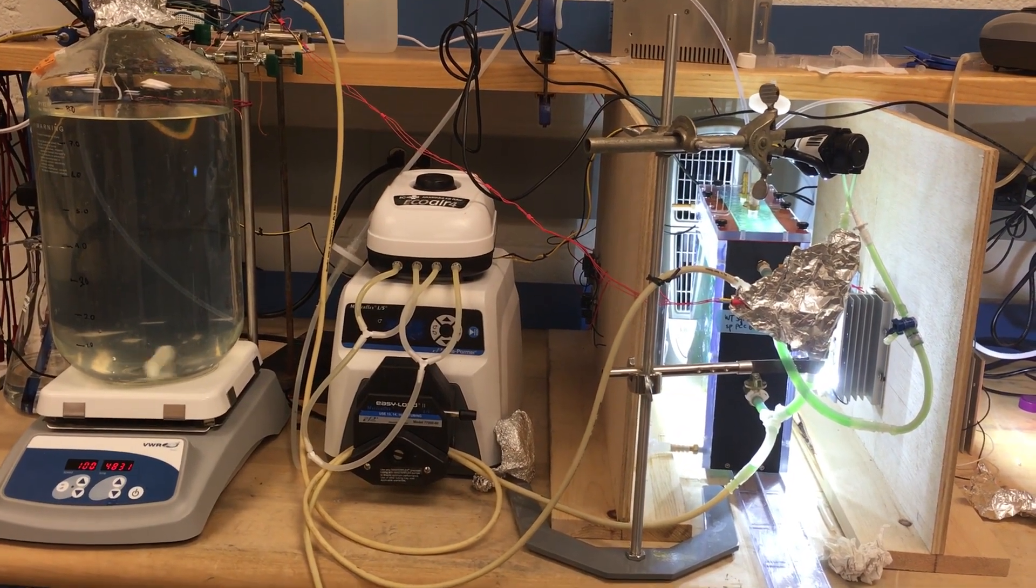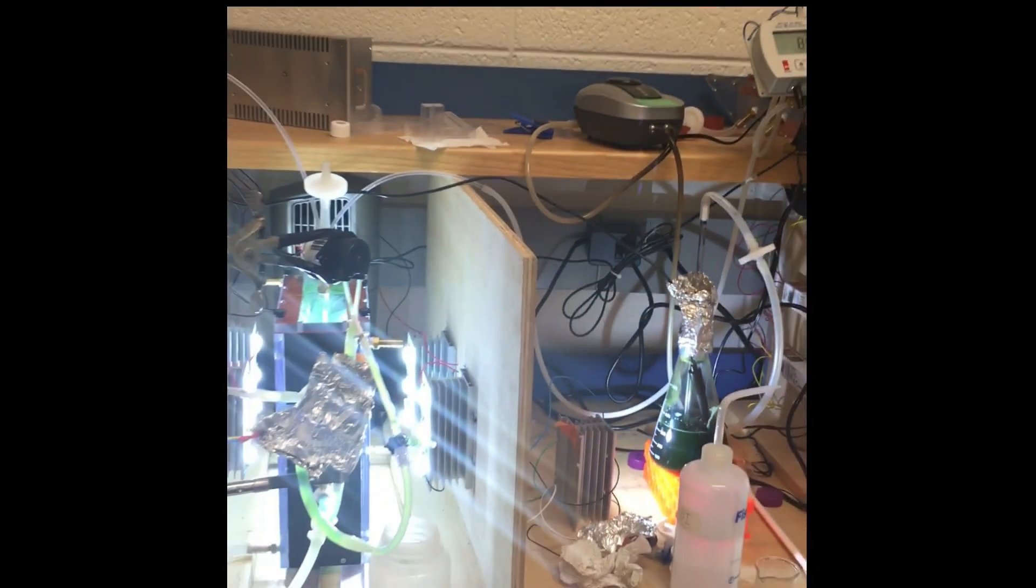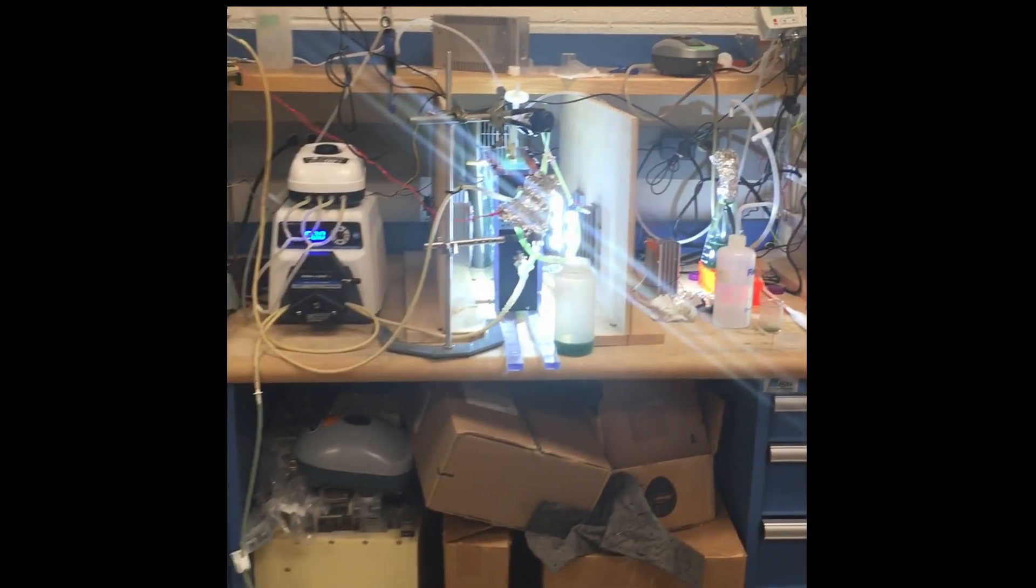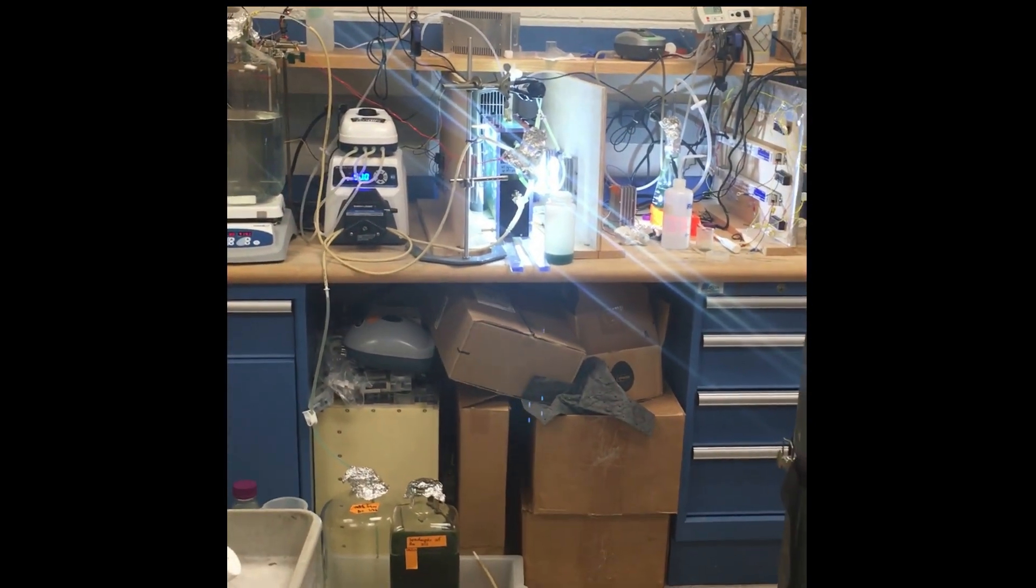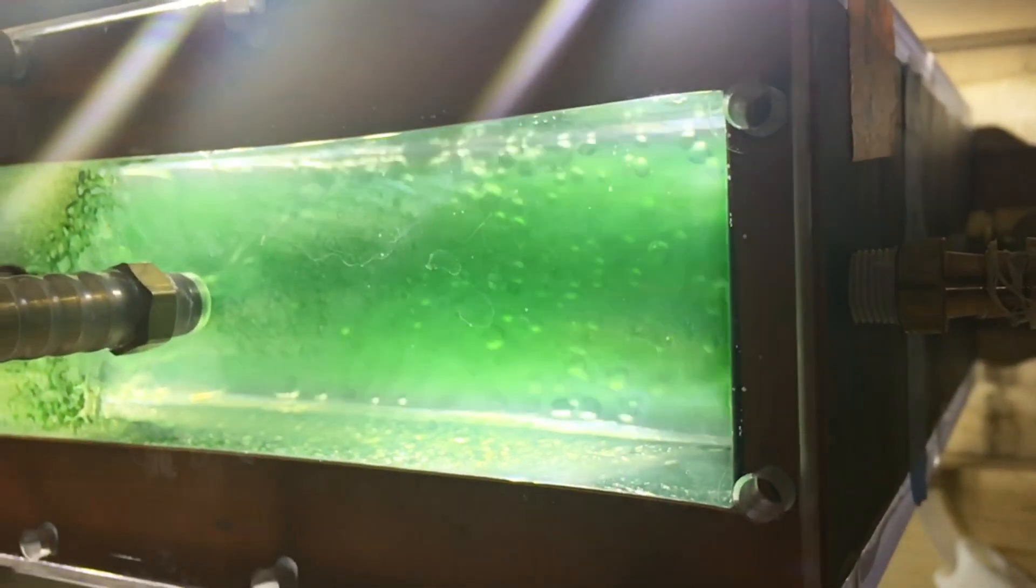So this reactor has a pH controlled by automatic addition of CO2. The key feature of this system is to monitor and control biomass densities by a turbidity sensor and an Arduino box.